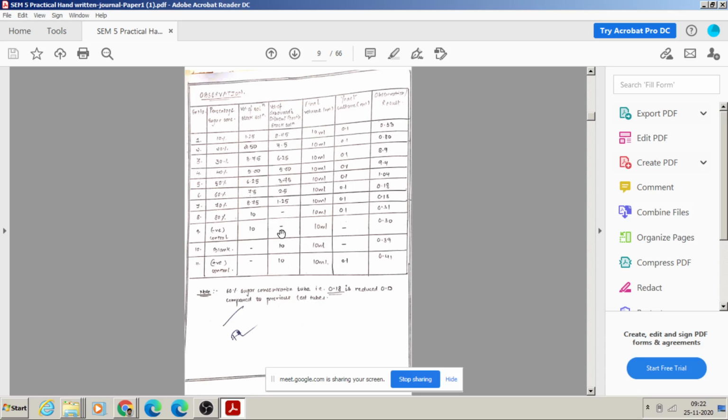In this stock solution we are not putting any diluent; it is a concentrated nutrient broth we have selected, which contains sucrose. Of course we have taken only 10 ml, and in this solution we are not putting yeast. Second, we have selected a test tube that contains only diluent and no sucrose, and in this test tube we are not putting yeast either.